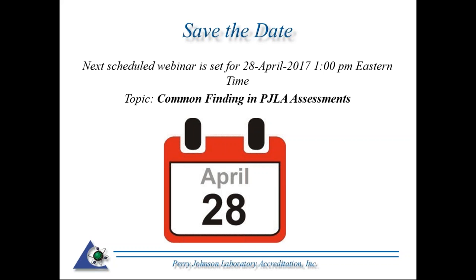If Ace, I believe the name was Ace Balance and Scale Company, came in there just to do their yearly calibration, and the as-found data was out of tolerance for that balance, if you were verifying that with the class one test weights, that would mean you would only have to investigate as far back as there was an indication that the device was actually out of tolerance. So in other words, if you had nothing in place during that year, like I said, the balance could have gone out the day after Ace calibration left, or it could have gone out the day before they got there. Without those intermediate checks and verification, there's no way of knowing.